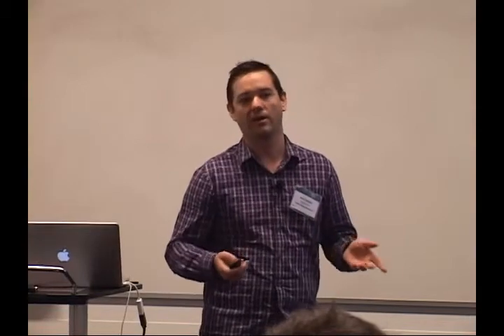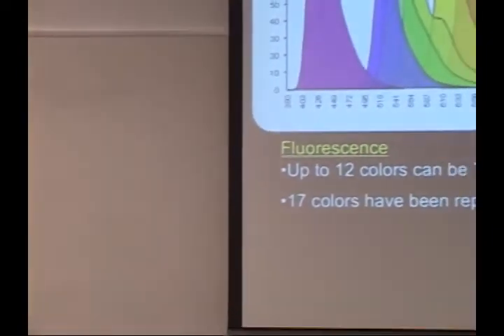And then also, I got this out of order here, multiplexing. When you start bringing in things like barcoding, which Eli is going to be talking about either later today or tomorrow, that uses more parameters. And this is, of course, a problem when you don't have a lot of sample. So if you have something like a clinical isolate or something that comes out of some small little piece of a mouse, and you can only run so many samples in the machine, you need to ask as many questions as you can with that one sample. And all of this comes back to why parameters are limited in single-cell measurements.